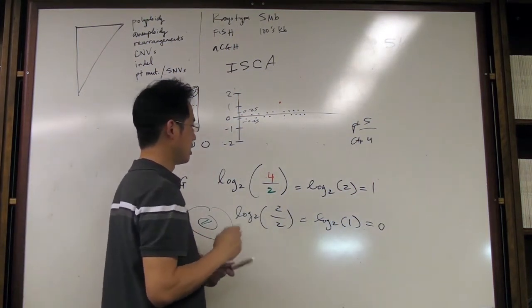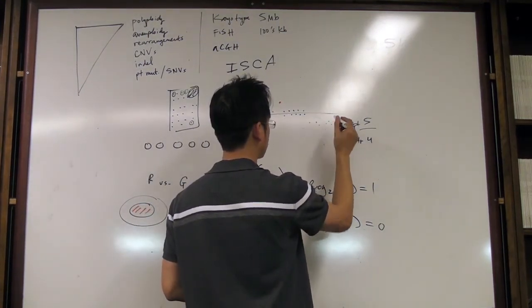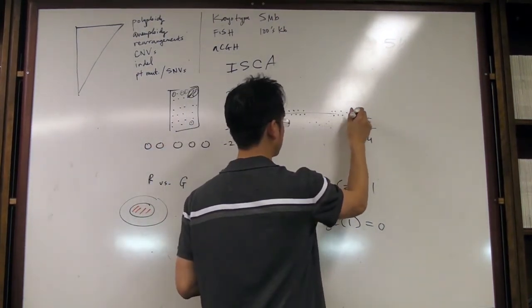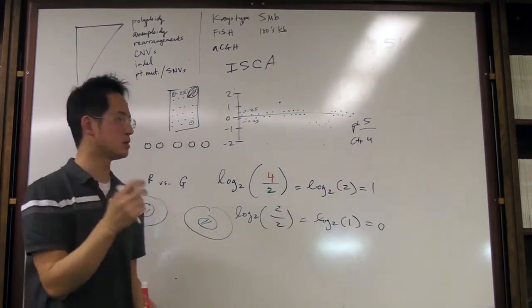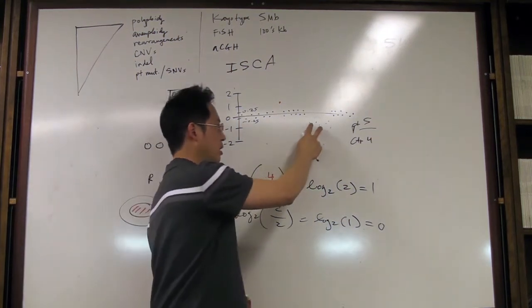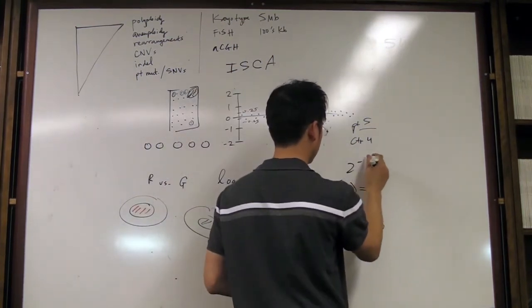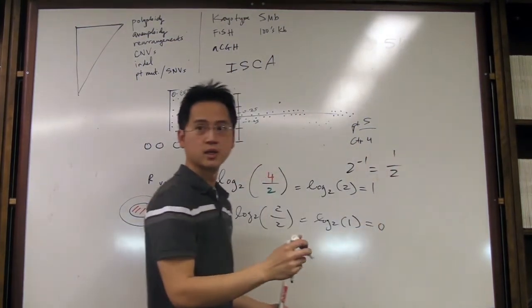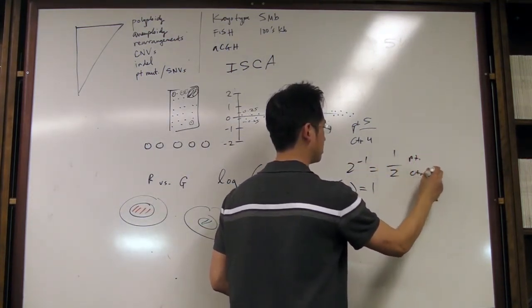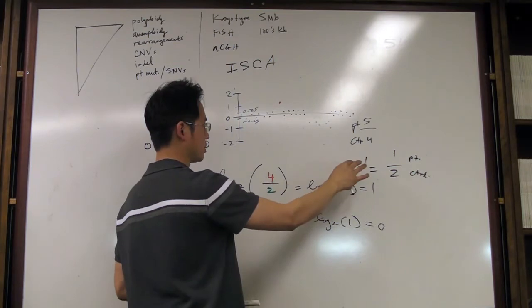However, let's say I go through and then there's another set of probes. There's 5 of them that all show loss to some degree like that. 5. And then things get back to normal. So now what I have is 5 data points that exist at various places on the chip that's all screaming to me and saying, yep, I have a loss here. And the loss is a -1. So 2 to the -1 equals 1 over 2, right? So this means that in the patient I have 1 copy and I have 2 copies in the control. So there's a 1 copy loss. I have now 5 data points that say, yep, there's a loss there.